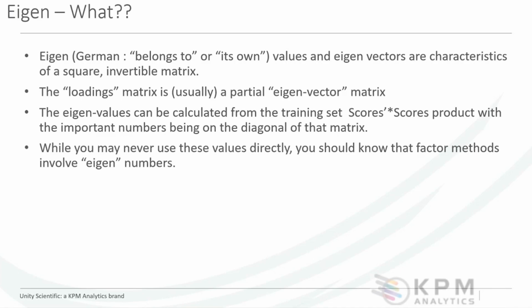We do have a couple of slides here. There is another way to evaluate complexity depending on the modeling we're using. In the beginning, we talked about feature selection, and we said that the more features, the more wavelengths we select, that's increasing complexity. When we are doing feature extraction, principal component analysis or PLS, we are adding factors or eigenvectors or loadings, and that's how we are increasing complexity.